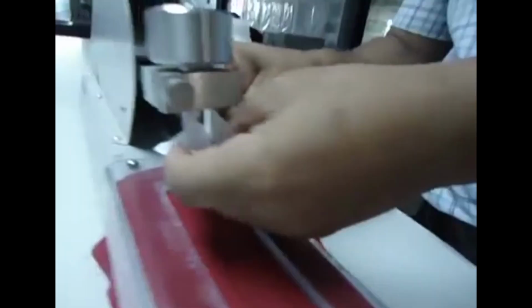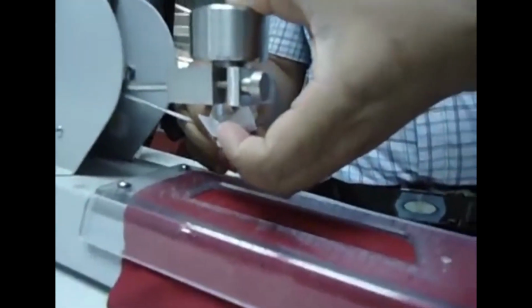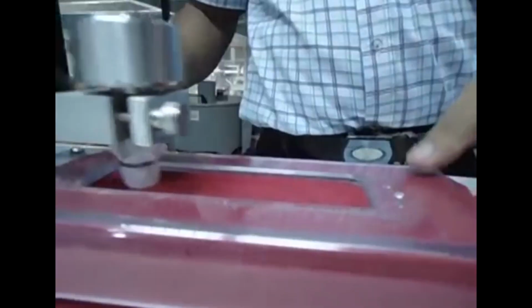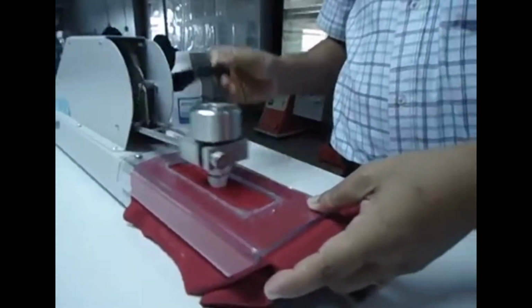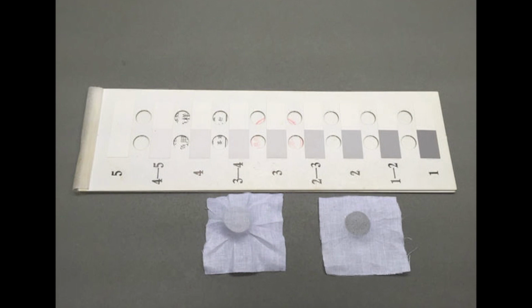The test is repeated another time for the wet fabric, by changing the dyed fabric as well as the white fabric and wetting the white fabric. In this case also, the color change and the color staining are graded using the grayscale standards.